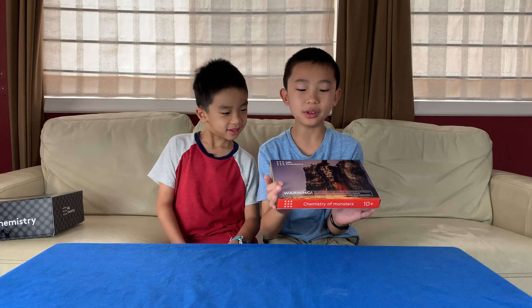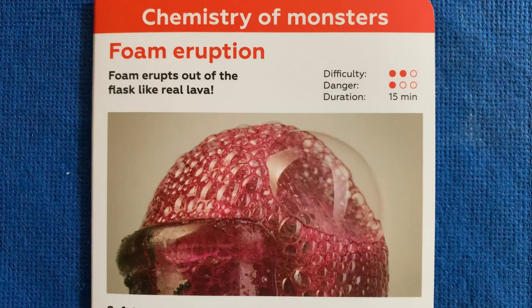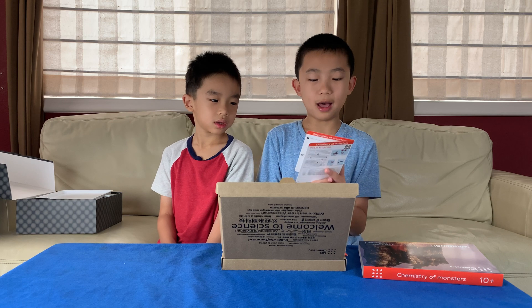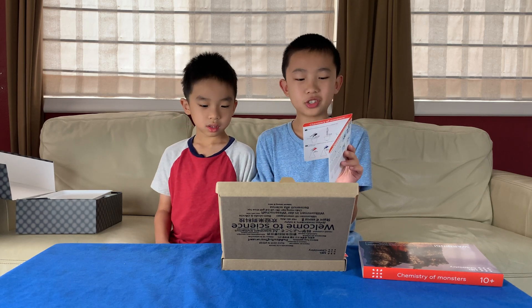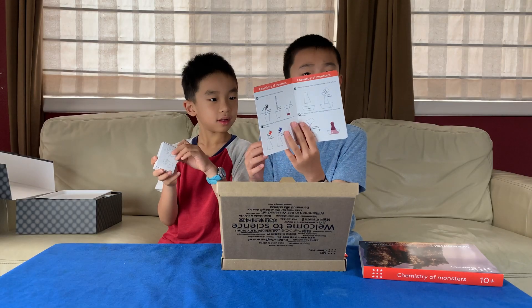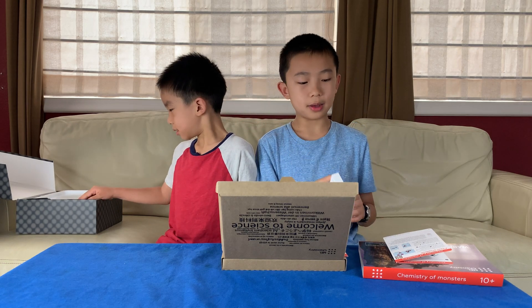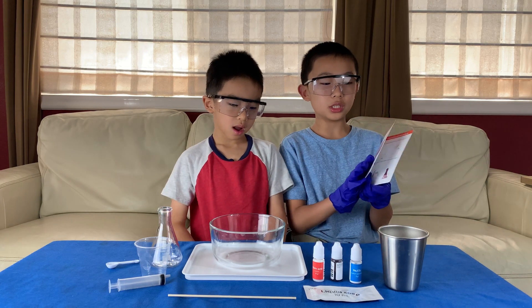It's time to unbox the Chemistry of Monsters. Welcome to science! There are two experiment booklets. One is the foam eruption, which has a difficulty of 2 out of 3 and a danger level of 1 out of 3. The description is: foam erupts out of a flask like real lava. It takes 15 minutes. For safety, we have to put on protective gloves and eyewear and conduct the experiment on the plastic tray. They provide step-by-step instructions. They also provide us the protective gloves - a small and a large. So we are ready for our first experiment: foam eruption.